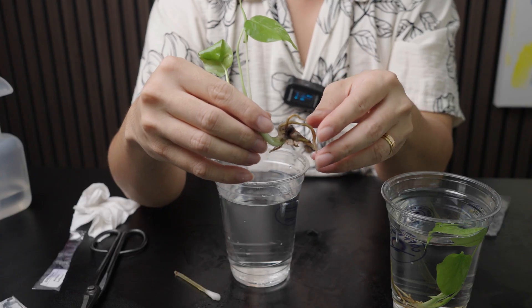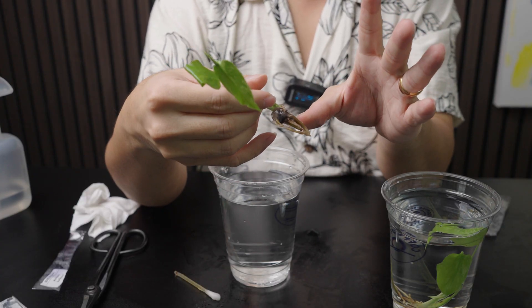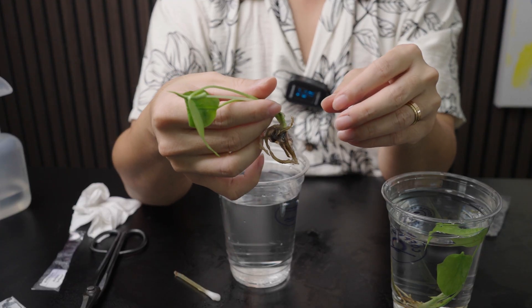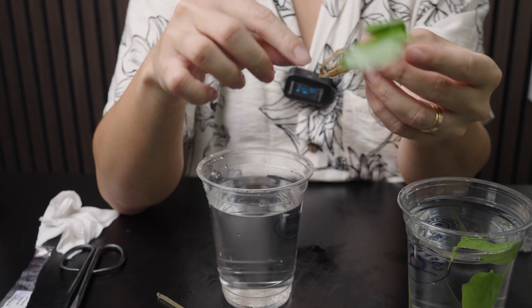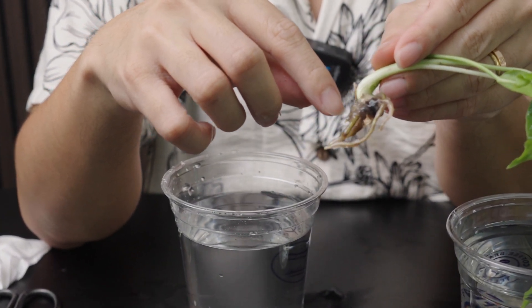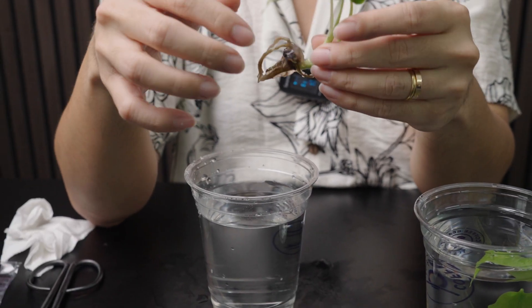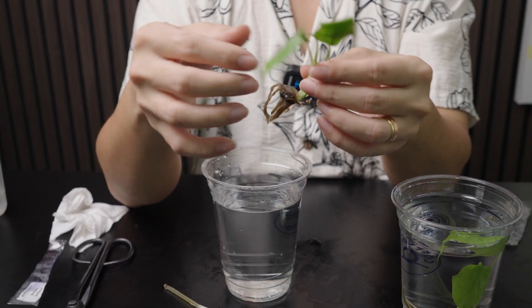I bought this tissue culture about a week ago but I caught a flu, so I did not deflask it as early as I would have liked to. You can tell that the jelly has a cloudy appearance — that's a sign that it might have been infected. So let us try our best to clean this up and hopefully the plant is still going to survive.